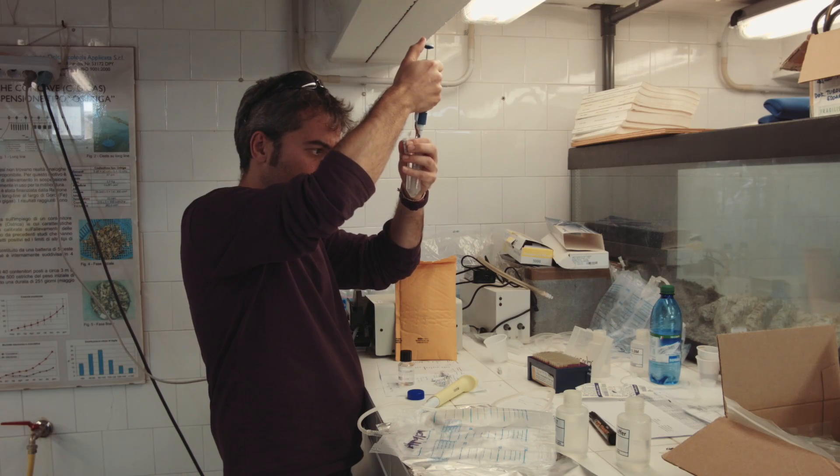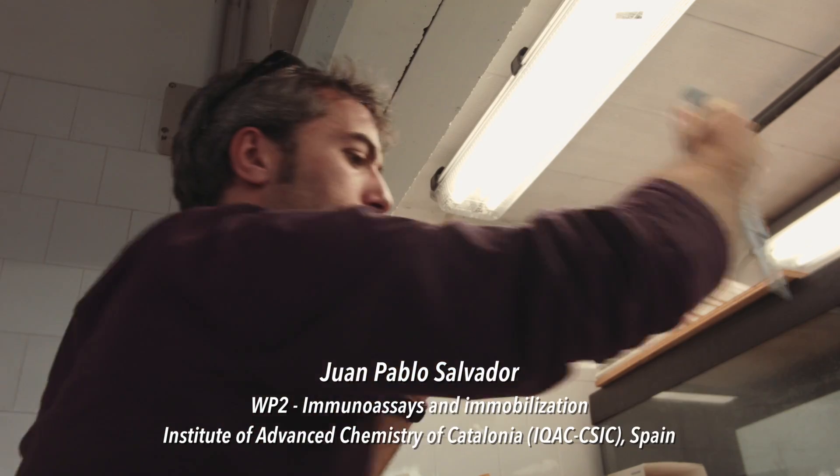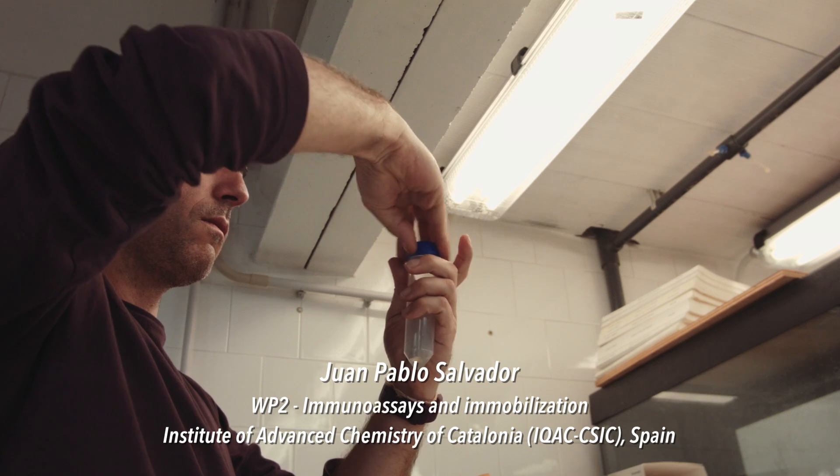My name is Pablo Salvador, I am the work package leader for the work package two. We are involved in the development of the immunoassay and testing the immune reagent for the implementation in the biosensor platform in the project.